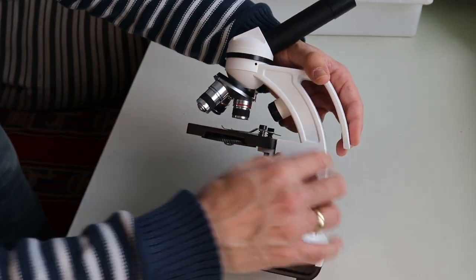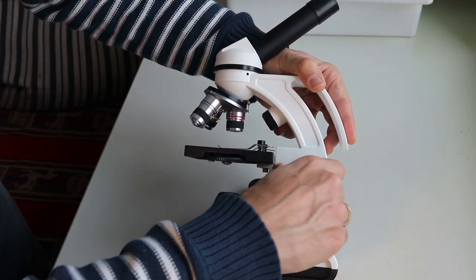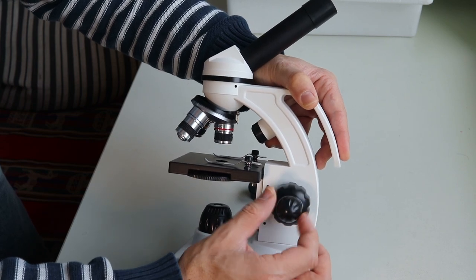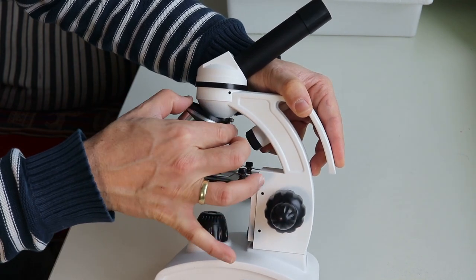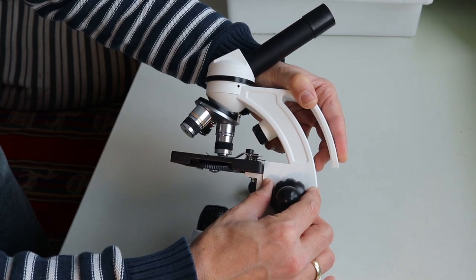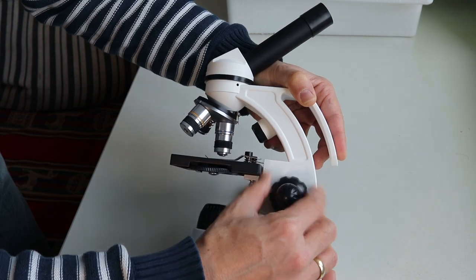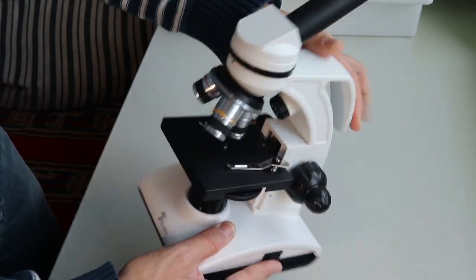So here I've got the 4x magnifying objective in place. This is the coarse focus knob. Okay. Yeah, this is the fine focus knob. When you turn the fine focus knob, then of course the coarse focus also turns a little bit, because of the gearing system. And I'm going to put in now the high power objective here, and let's see if it crashes. You got to be careful, okay? So there is no built-in protection to prevent the objective from crashing into the slide. So well, good to know, okay? So that is basically the way it looks.